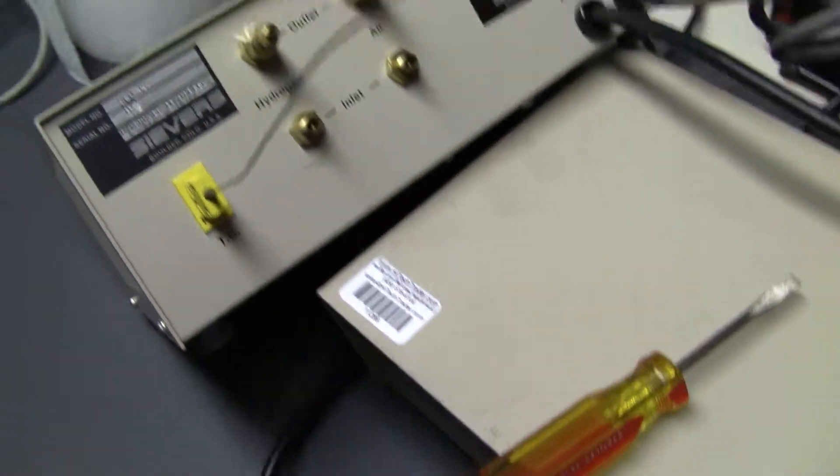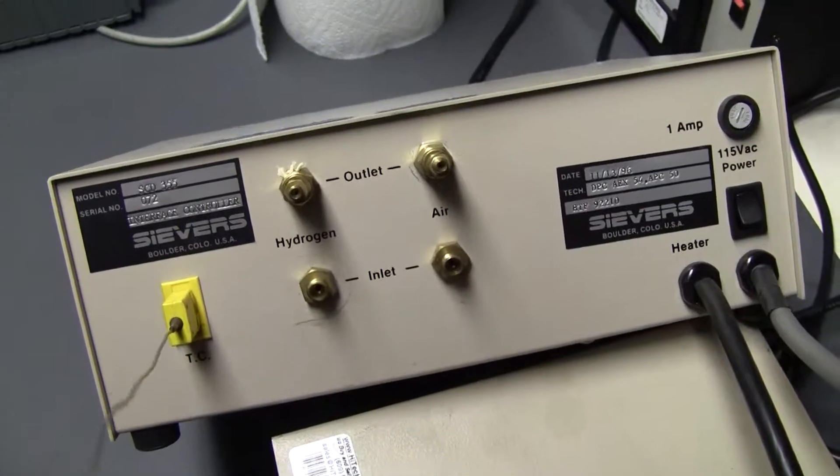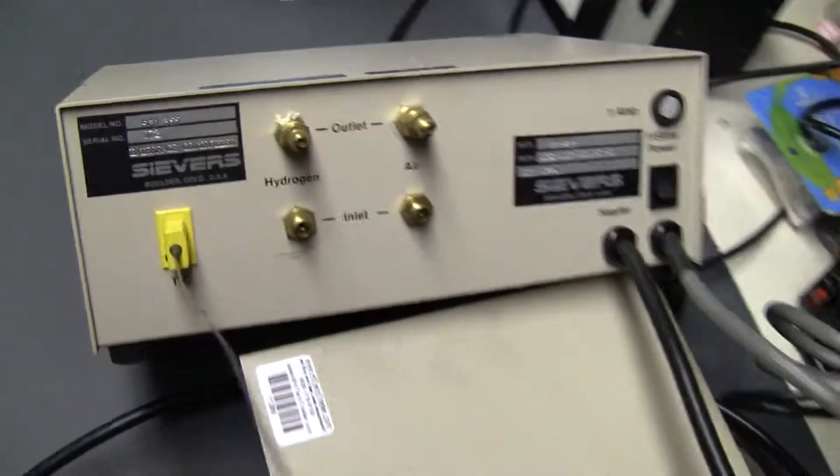Looks good. The model is, once again, SCD355. 1996. Thank you.